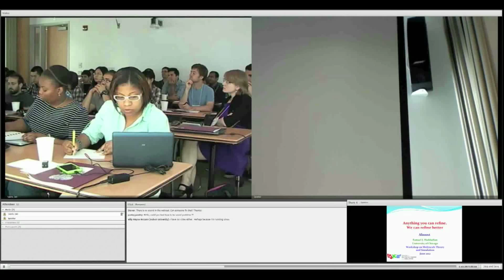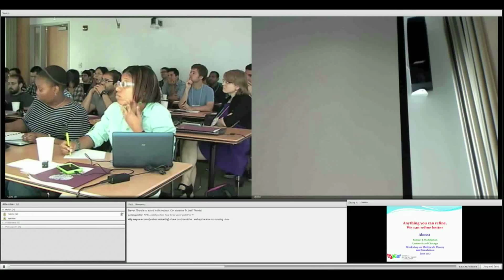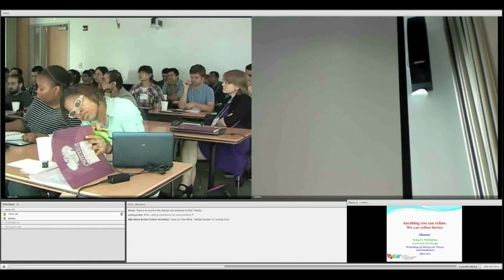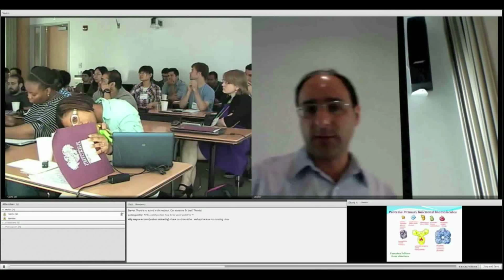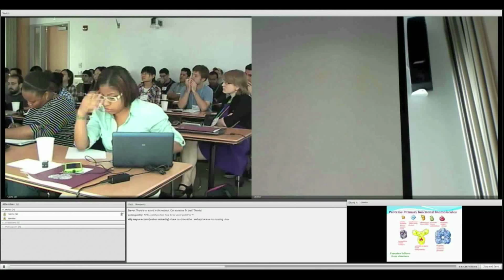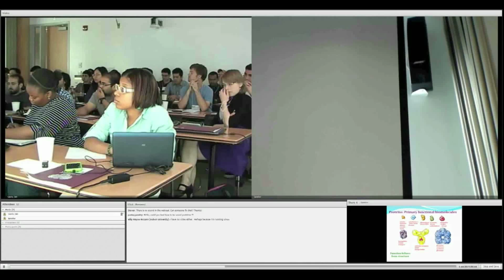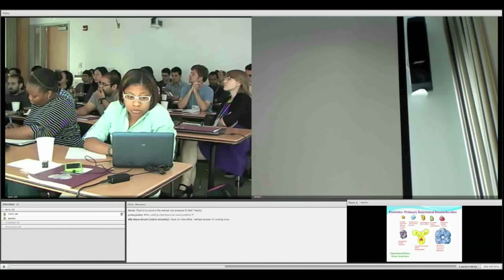So pretty much we can refine any structure that is there out in the PDB data bank, but there is a catch. We can do this almost. The important thing is that if you want to use this sort of real space improvement for your structure, which can include NMR, cryo-EM, or crystal structures, you want to use it at the earliest stage of the refinement.